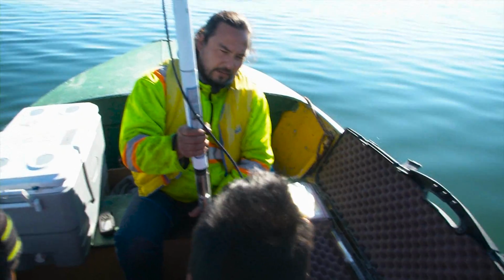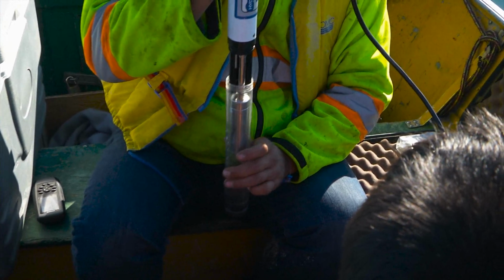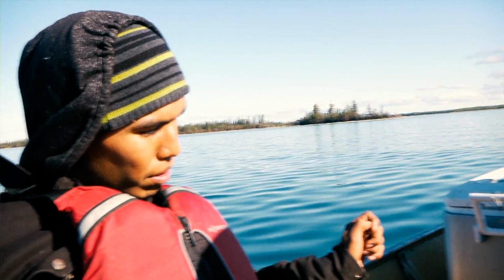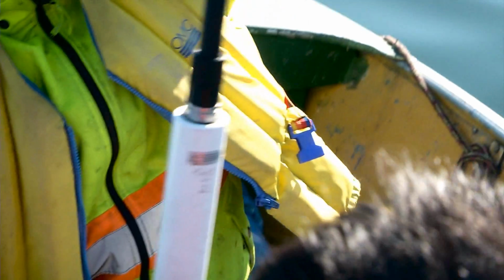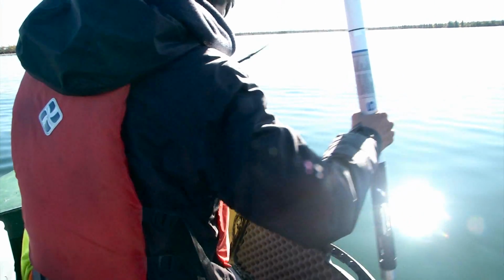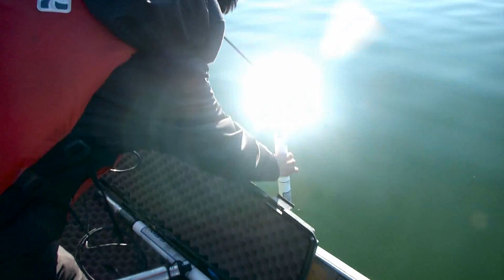The sensors and everything moist so they don't dry out. You can use regular water, but for this one they added chemicals. This here is waterproof, so you can have it in wherever you want it, at any depth you want. Yeah. Go for it. It's yours. And you don't want to let it go. Just hold it in at one height. Drop it in.